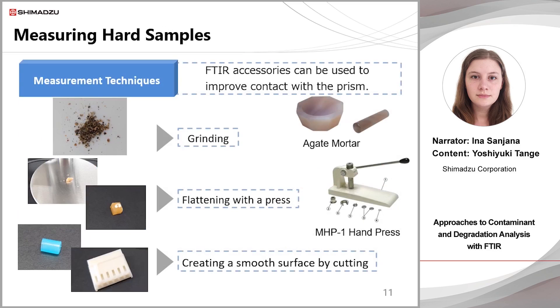Although ATR spectroscopy requires no pretreatment, the accuracy of qualitative analysis can be improved with a small amount of pretreatment. For ATR measurements, close, even contact with the prism is an important factor in obtaining a good spectrum. Hard or uneven objects have poor prism contact and it is difficult to obtain a good spectrum. Here are three ways to improve prism contact: if the substance is powdery, grinding it more finely will increase the contact area, using an agate mortar as used for making KBr pellets. When there is no flat surface, flattening with a hand press can be effective. It may also be possible to obtain a smooth cross-section by cutting the sample, which allows more contact with the prism.